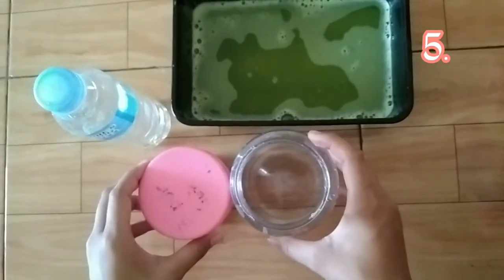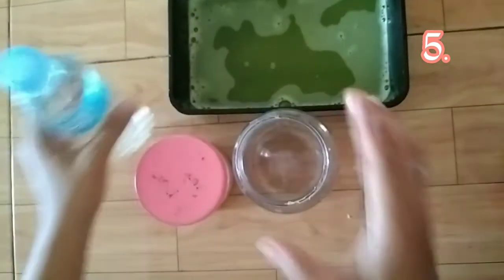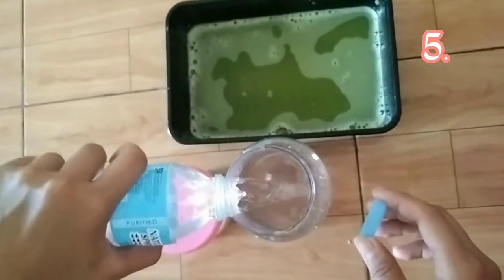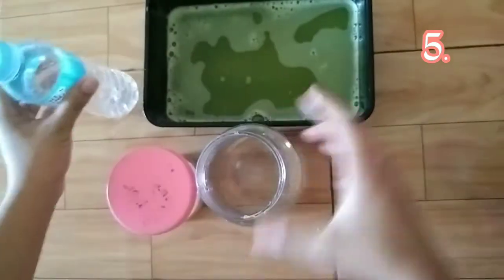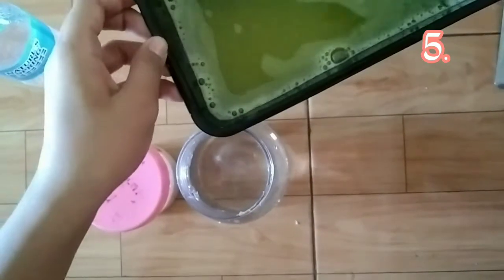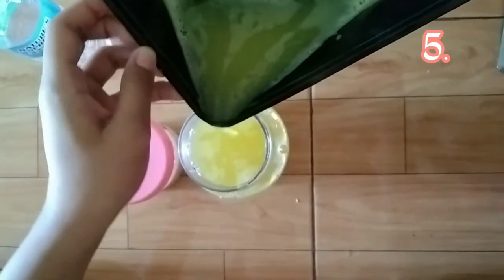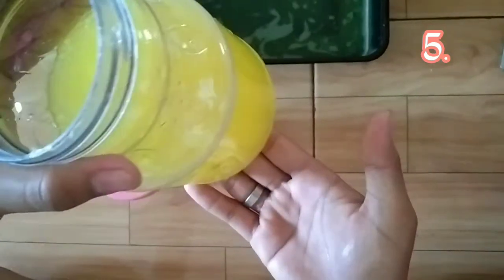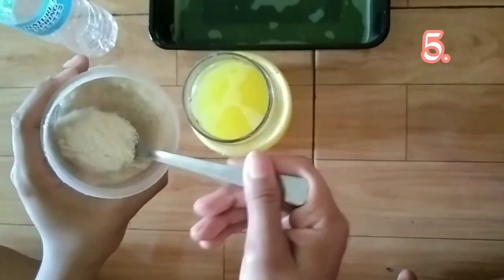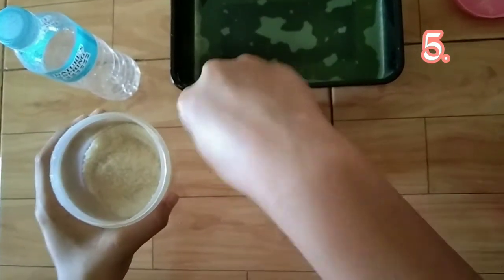We are now in the process of mixing the juice with water. This is a container. Let's put in 150 ml of distilled water, then the pineapple juice. Let's put in 2 teaspoons of sugar.